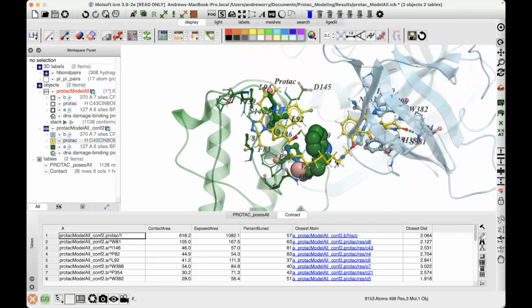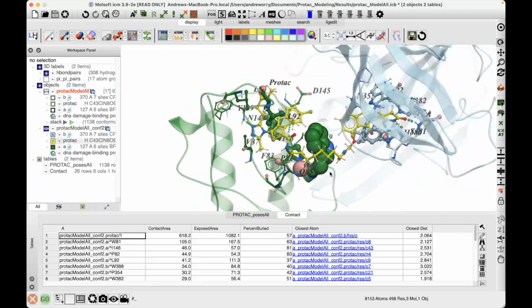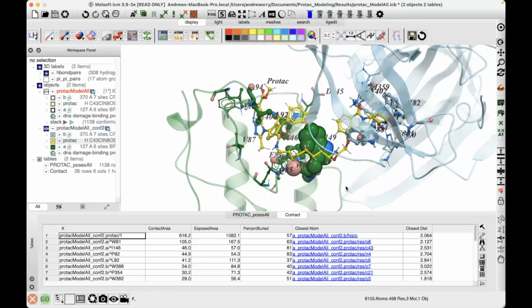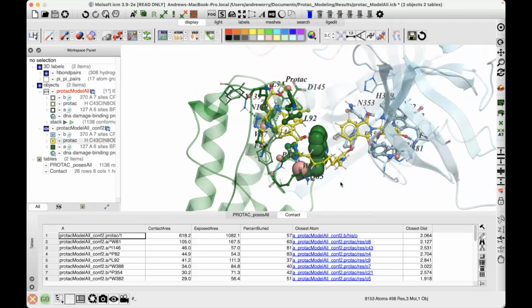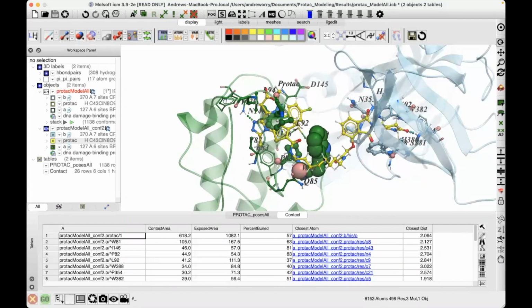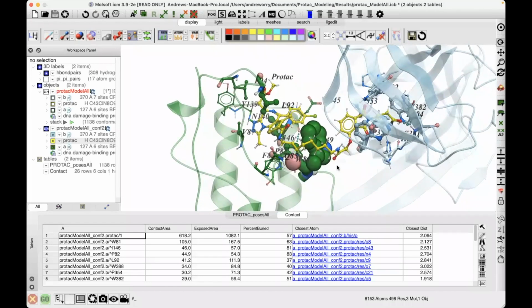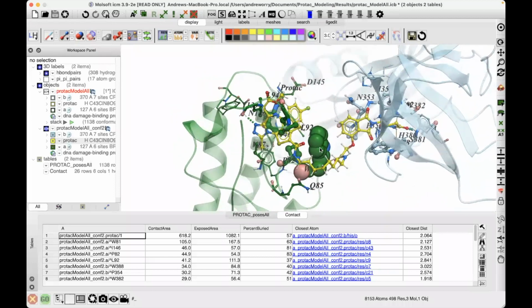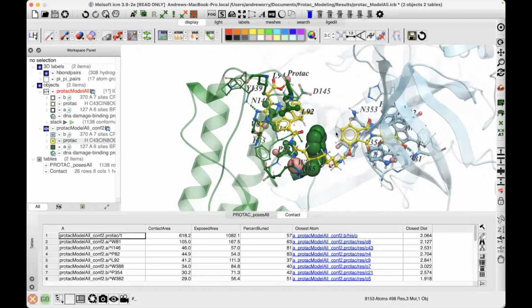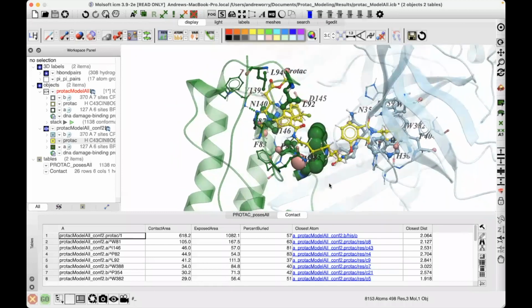It also gives a scale to the side chain representations for how much contact each makes. So this tryptophan makes the biggest contact with the ligand, so it's in thicker stick. So the thicker the stick representation, the better.